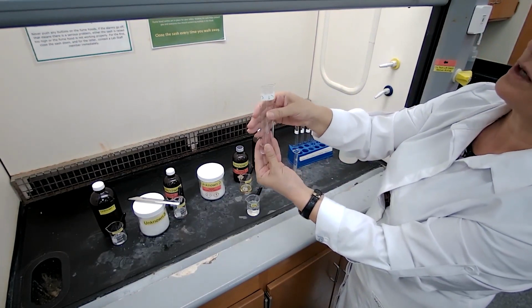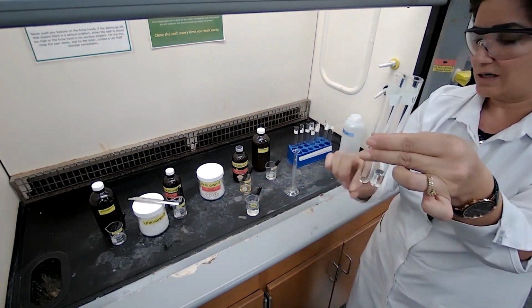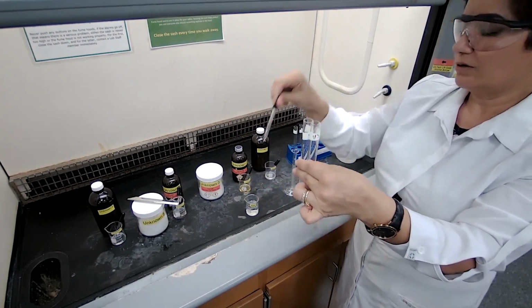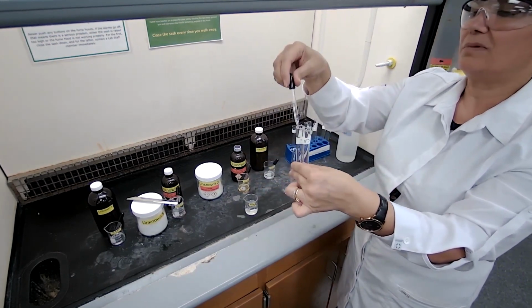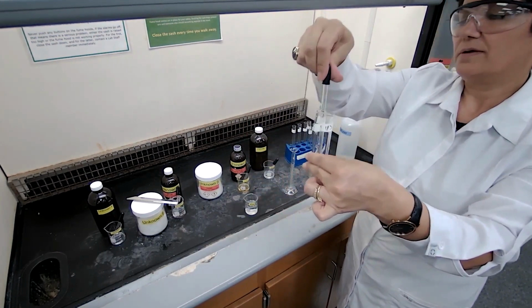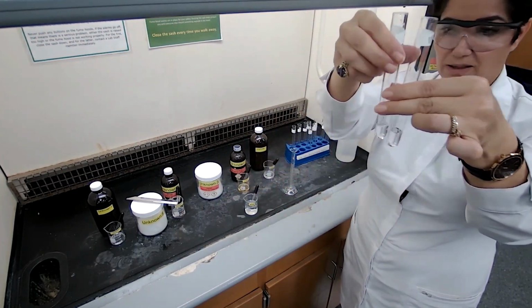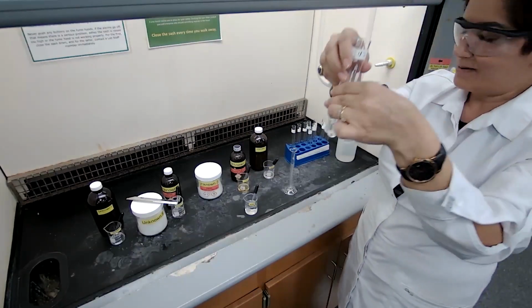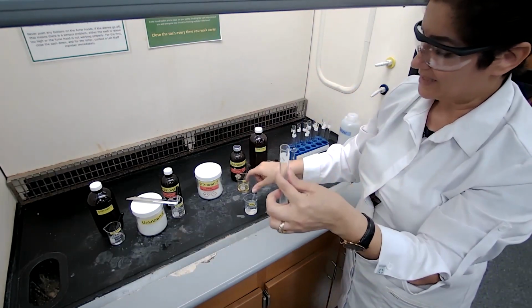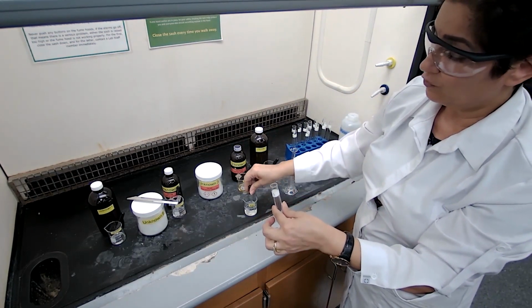If the test tubes are the same size, I could hold one test tube against the other and add enough solvent to make the same level, so that is 3 milliliters, exactly the same as the other one. Or I could just use 3 full droppers.